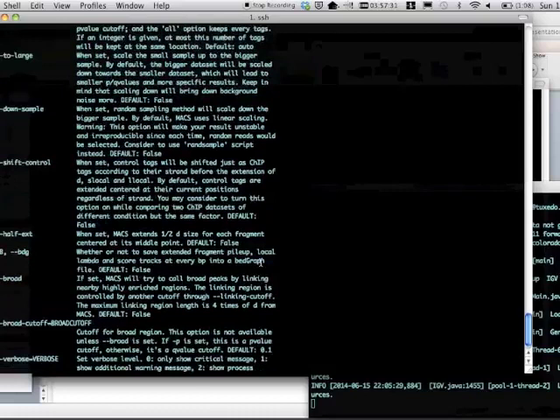And we can specify the file name, and we can also use the -v argument, which is a verbose flag, so that it will provide as much information as possible about the job submission and every step of the way. So this job is now submitted.